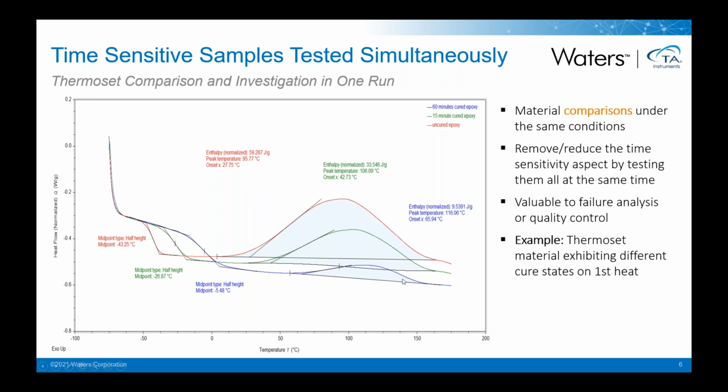But you can see, let's reverse this a little bit, and you can say, well, I have an epoxy. I want to know different formulations. Maybe I want to know how each of these are going to react under different conditions. If I wait for some amount of time between sample 1, 2, and 3, there's a potential that you're going to get some variation in these exotherms, and then it may not be able to tell you the information that you're hoping to capture in the DSC.